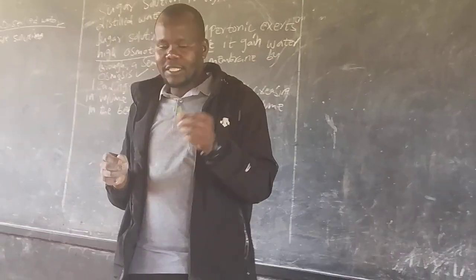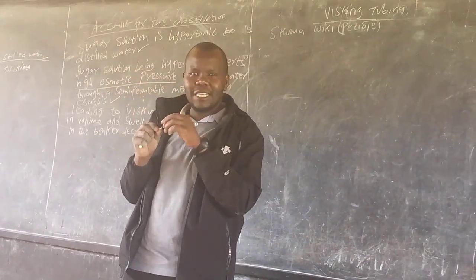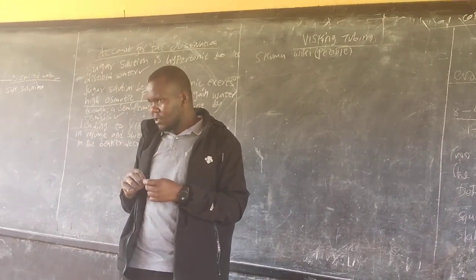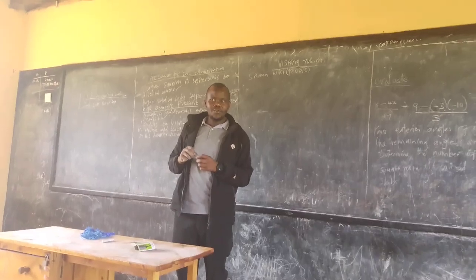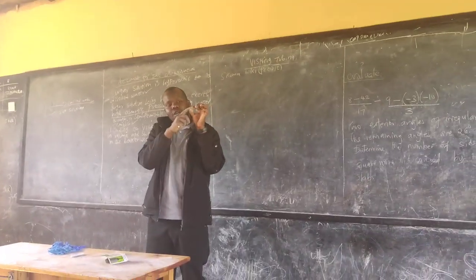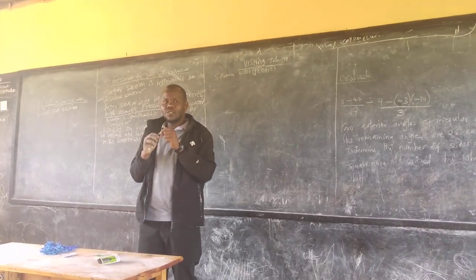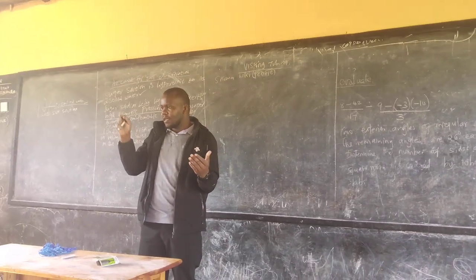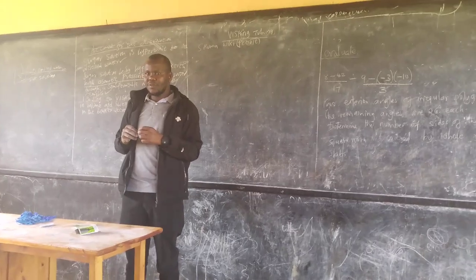Right? That's the first one. We have another second experiment. We are told to cut this length, which is 6 centimeters and 6 centimeters, right? You have two. One again in distilled water, one in a hypertonic solution. If you make a complete half, you cut the split, so you have just one. You split into two halves, right? Those two halves, you insert one in distilled water, one in hypertonic. Is that clear? Then now we check your observation.